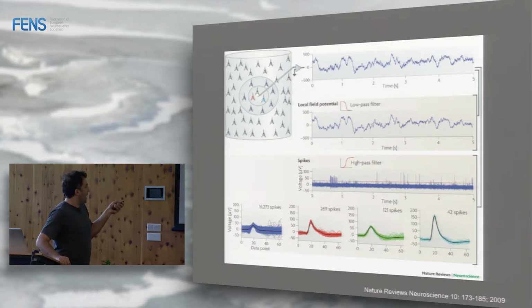Now, this red, green, and blue, and cyan correspond to these three neurons, the ones that are close to our electrode. But neurons that are further away, the signal is a bit lower because they're too far, right? So the amplitude is smaller, and they are more contaminated by noise. In technical terms, the signal-to-noise ratio is lower. We don't have much signal. So these neurons here, in this annulus here, we cannot split anymore. We cannot really tear apart the shape of one from the other. And we group them together and we call multi-unit activity.